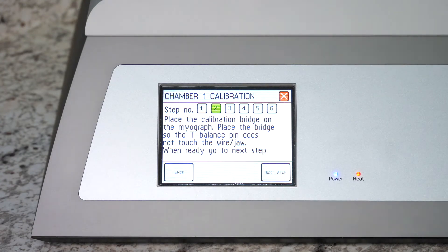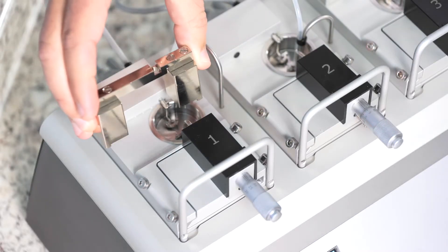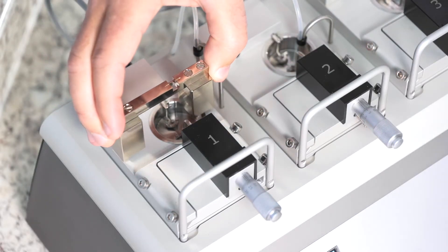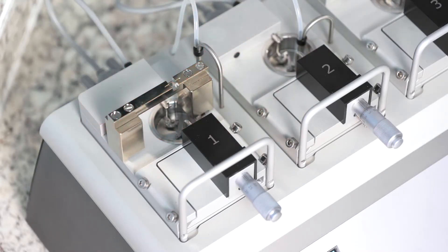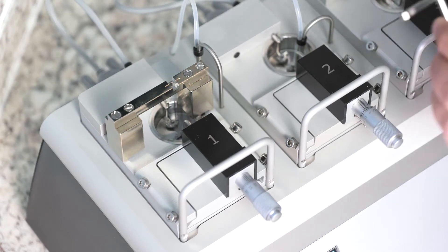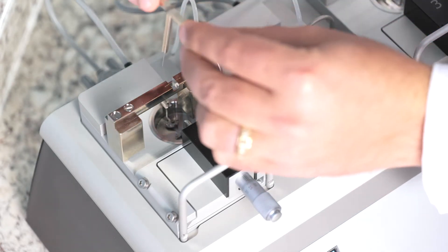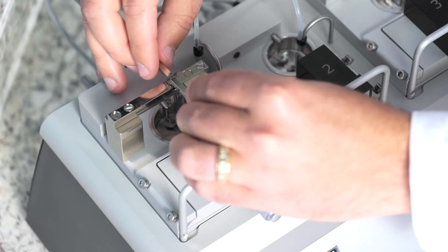Step two tells you to place the calibration bridge and T-balance on the chamber. So we will place the calibration bridge over the chamber and then we will take the T-balance and drop it into the chamber in the grooves of the calibration bridge.